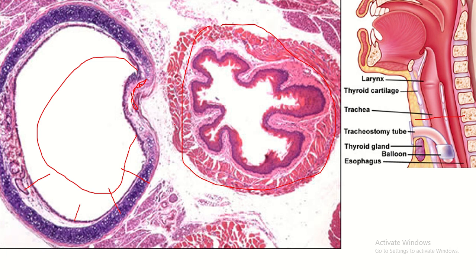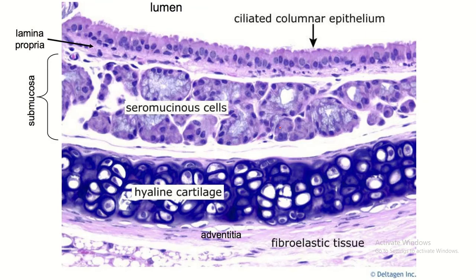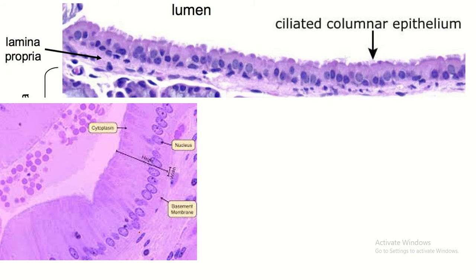Just behind the trachealis muscle, the esophagus is situated, so food material easily passes through the esophagus. The mucosa consists of the lining epithelium and lamina propria. The submucosa contains seromucous glands. This is the hyaline cartilage and this is the adventitia — adventitia means collagenous connective tissue.